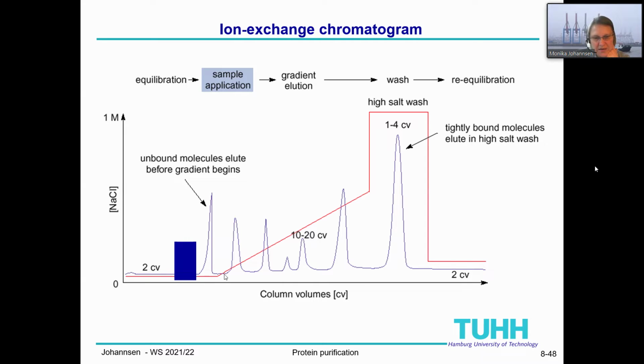The red line in this graph shows the salt concentration in the mobile phase. During our presentations, we were sometimes talking about gradients. This is a kind of gradient, so it means that we change the salt concentration in the mobile phase.